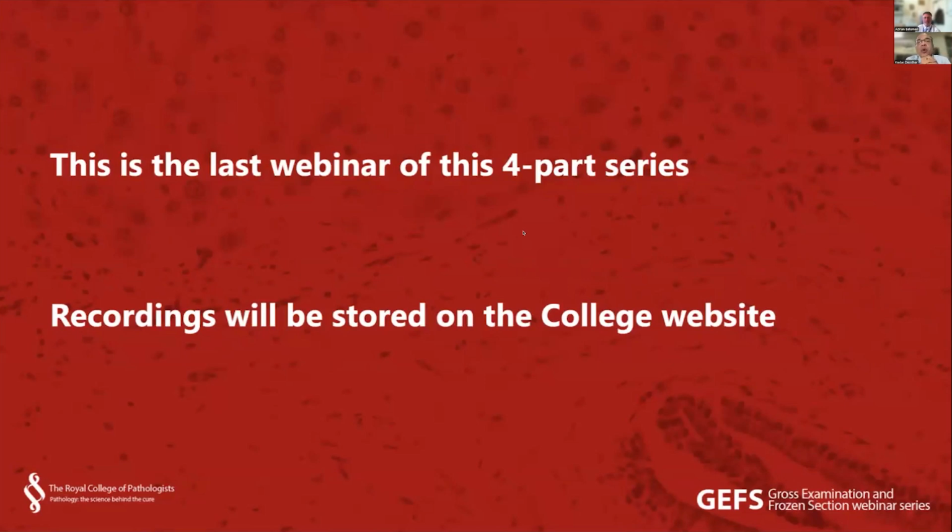This positive lymph node at or near CRM can influence margin status. However, shelling them out from shredded fat precludes this measurement. Would you recommend the tedium of serially slicing fat at CRM to look for nodes in order to avoid this, even if it means using more cassettes for accidentally bisected lymph nodes? Yeah, I think in practical terms, I think that's right.